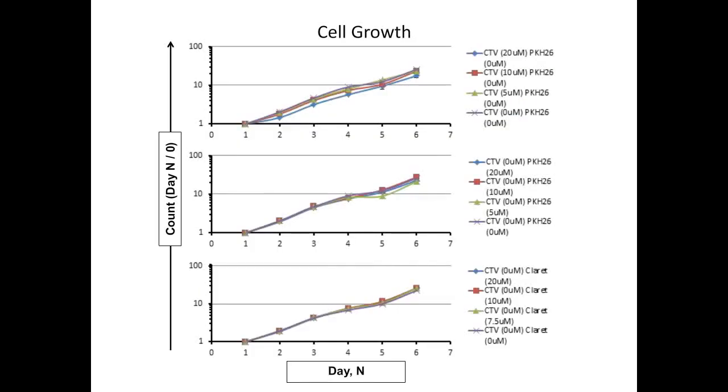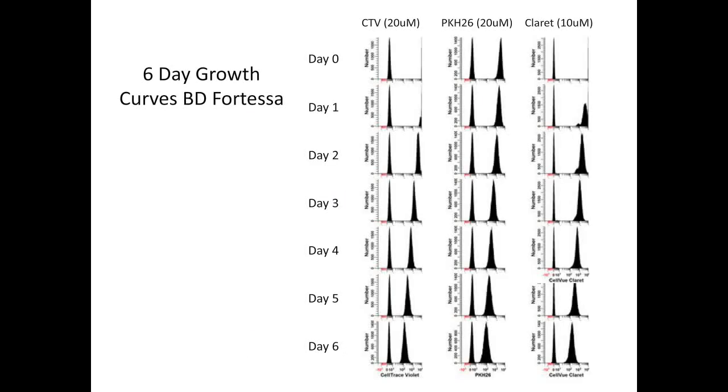Looking at just cell growth, this is days in culture, and looking at the expansion, it's a log scale on the y-axis, and you can see that these are essentially in log growth. On day 5, you can note, particularly in the middle one, that there's a slight bump, and that's actually when the culture was changed. It was refreshed because the media was getting depleted. So we're in logarithmic growth.